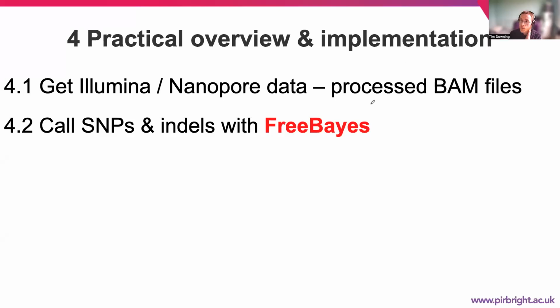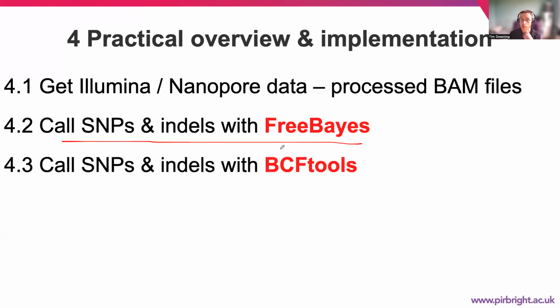So welcome to demonstration video 2 as part of our course G04 on mutation detection. This video is on SNP calling and indel calling with FreeBayes. That will be followed by the equivalent ones for BCFtools and the other steps mentioned previously.